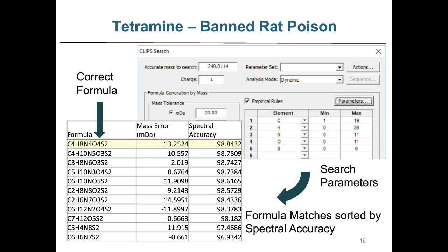I should mention that it's a relative measure of the goodness of the fit of the true, or calculated, mass spectrum to the calibrated mass spectrum, where 100 is a perfect match. Of course, we always have noise, and usually there's some level of background interference, so it's never a perfect 100. But when you get up to around 99%, that's a very good indicator of an excellent match. And we'll look at some visuals of this.